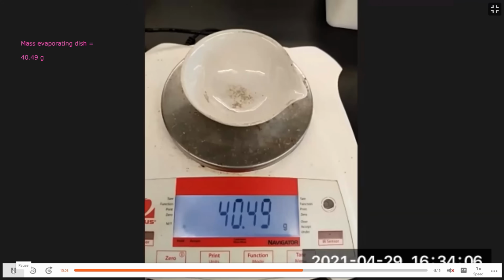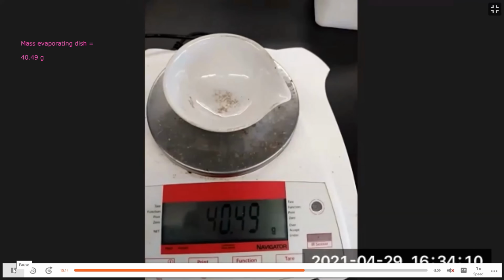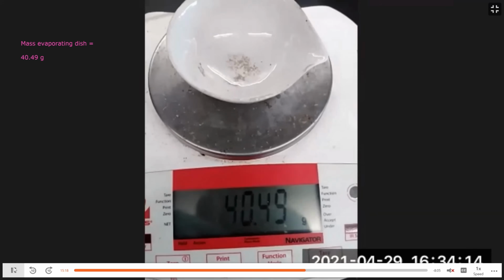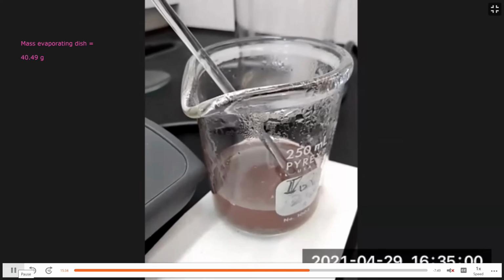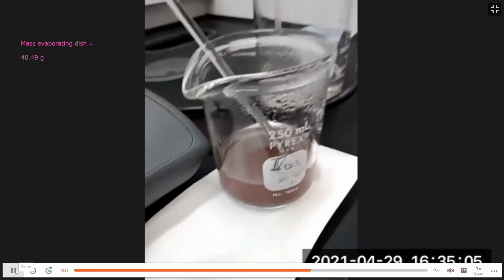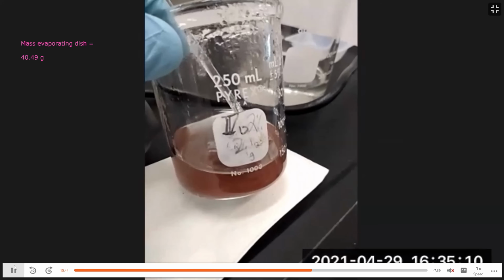And so we're going to have to wash the copper now and place it into the evaporating dish. We need to wash the copper and transfer it from the beaker to the evaporating dish. So you can see the copper in the beaker.